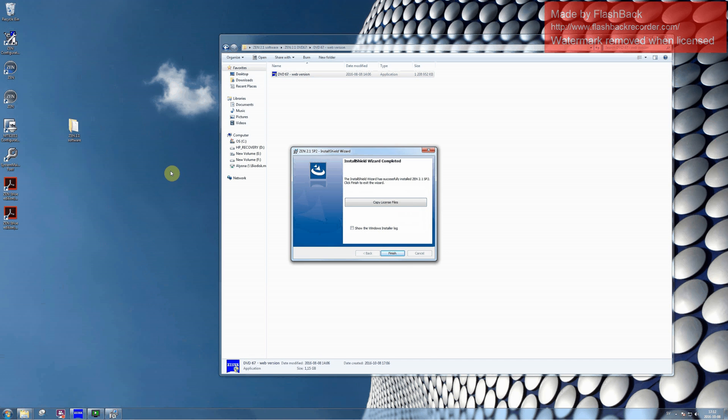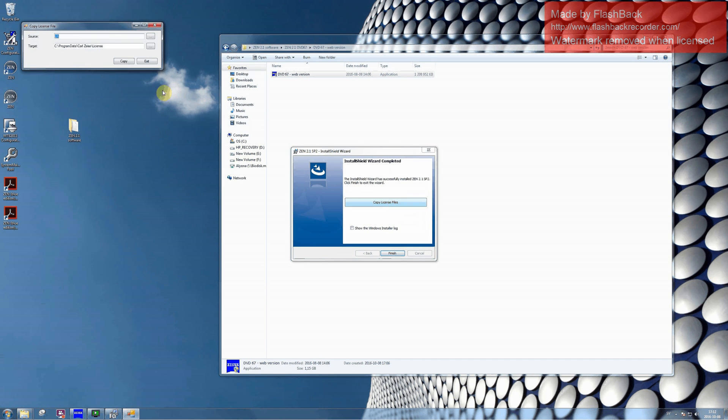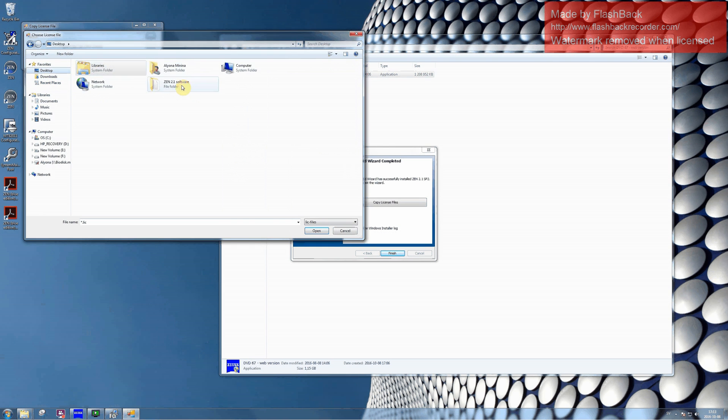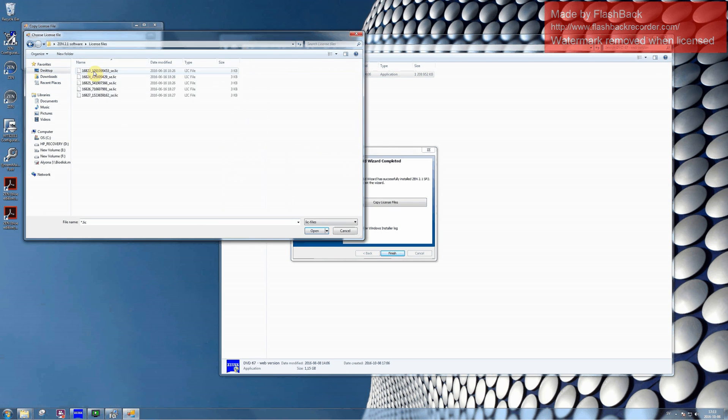Proceed with copying license files. You can find the license files in the same folder with the installation files. Please copy them one by one.